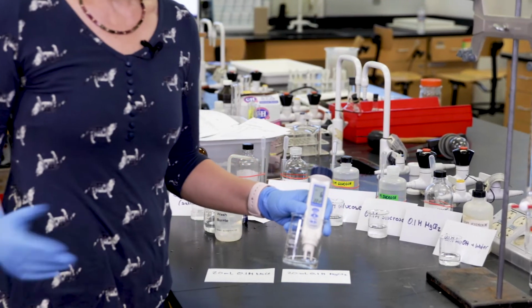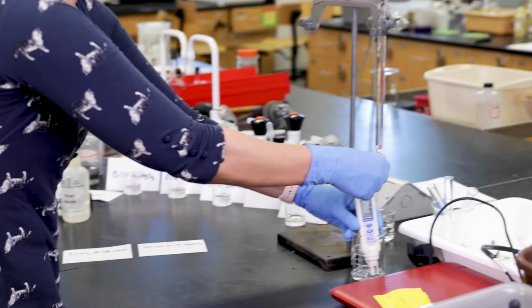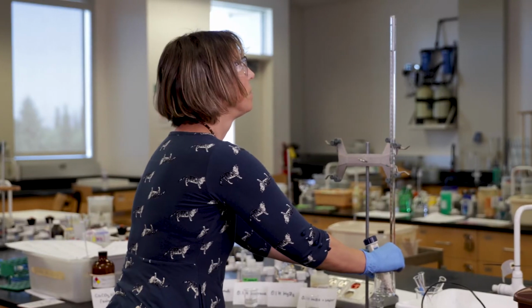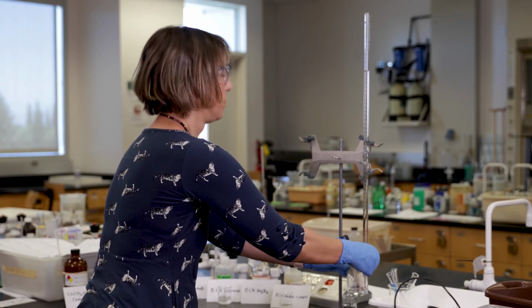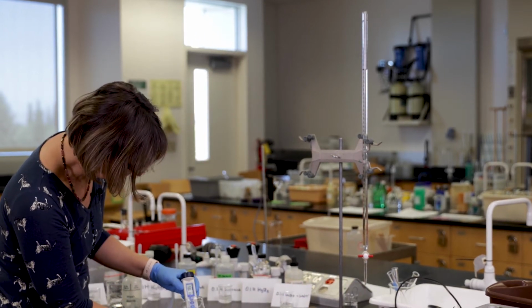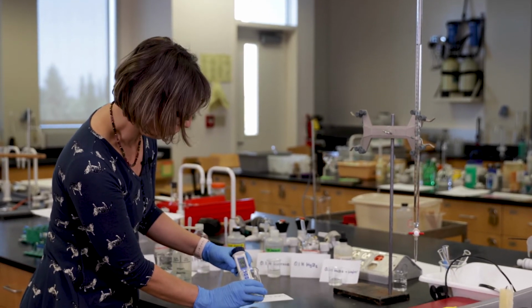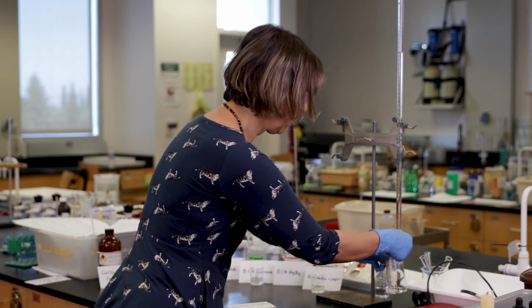Okay, so what happens if I add 10 milliliters of water? I use this burette to add water to this solution. First 10 milliliters. And let's see what changes. So now the conductivity is at 5.42 millisiemens.